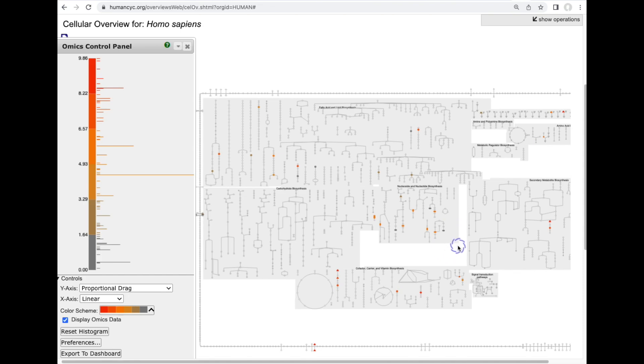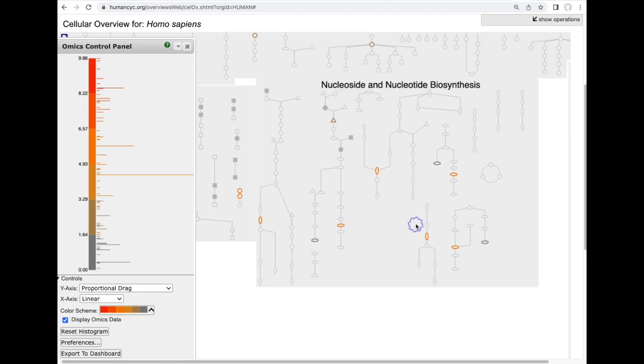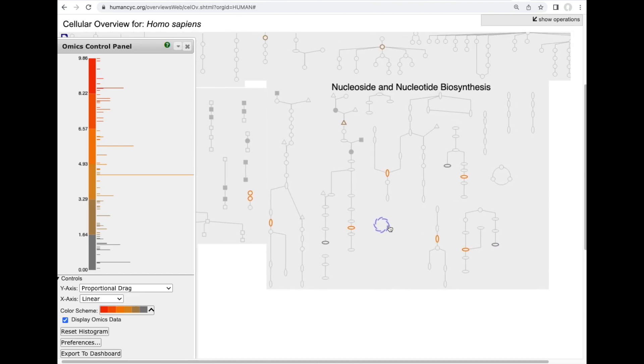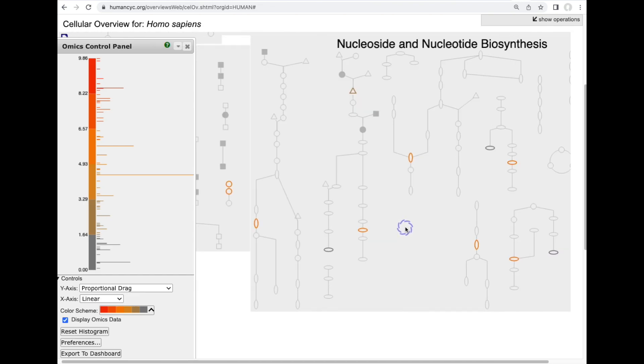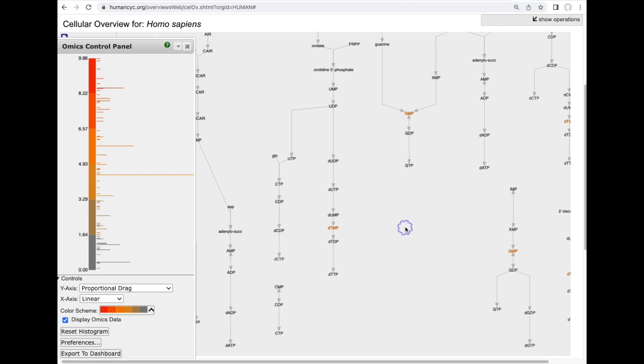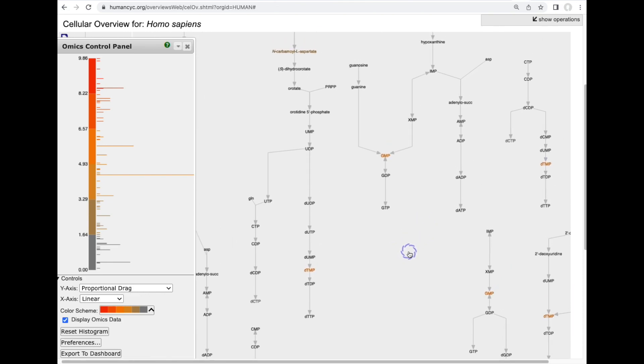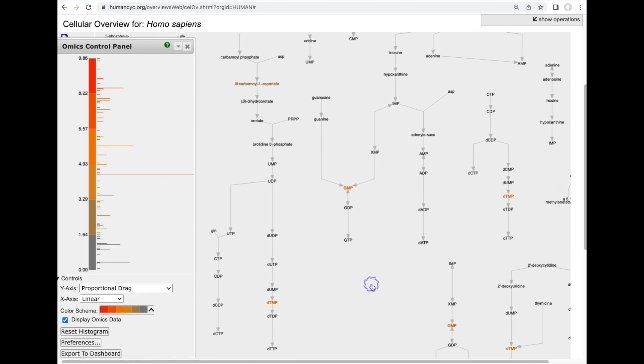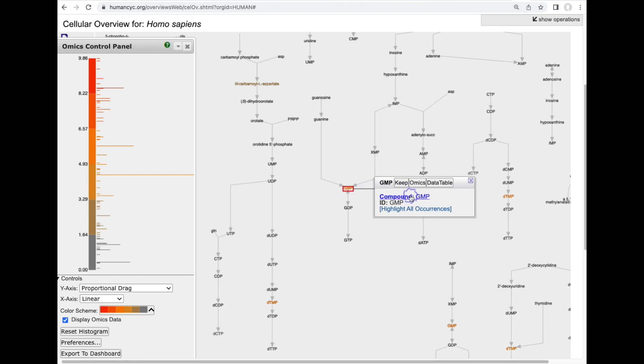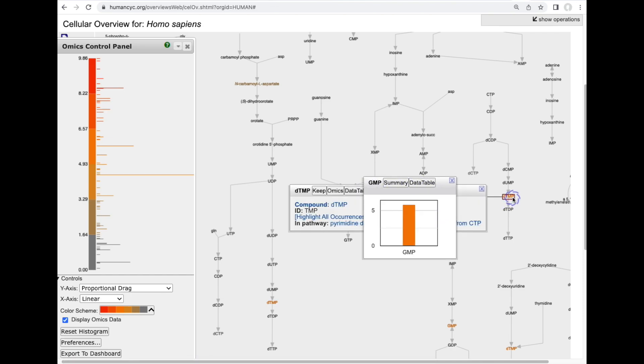Now we can also use this same metabolic map diagram to visualize metabolomics data so here we've read a metabolomics data set into our human metabolic pathway map and we can look at more detail at the metabolite levels in this data set and we can also graph metabolite levels as well.